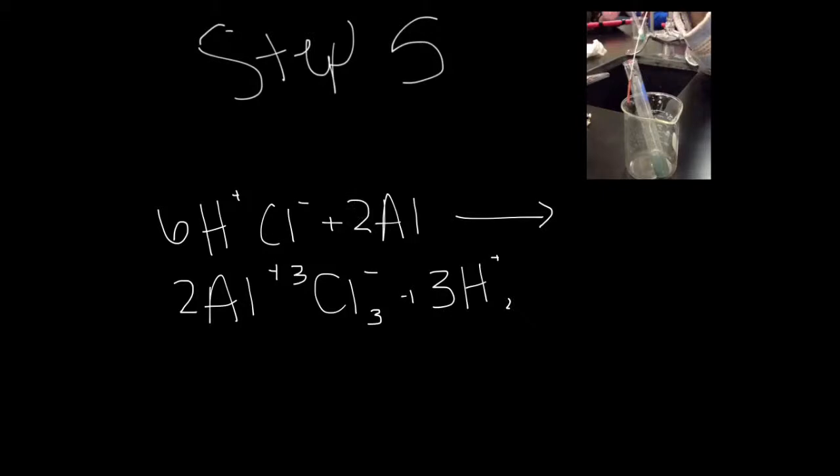and then it's balanced. The chemical changes that we saw were the changing of the aluminum wire and the precipitate left in the remaining solution.